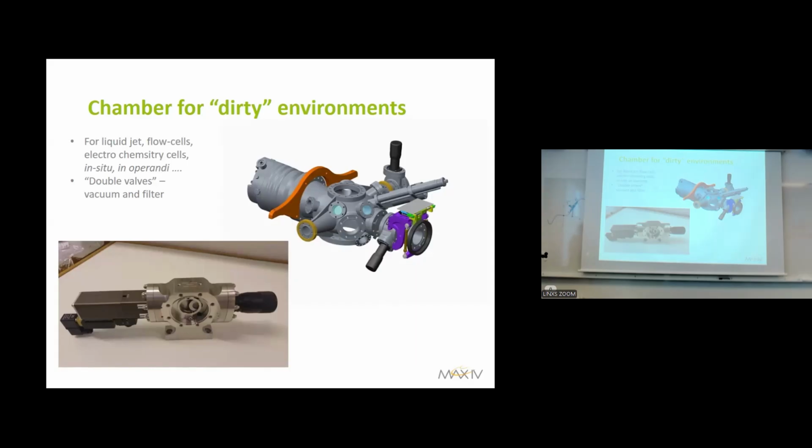And this has been even further refined by our beamline scientists. So now I think we can run the inner atmosphere. We added some differential pumping stage on this, and added further differential pumping on the sides, more liquid nitrogen traps to collect all the vapor and everything. So I think now we can measure something like 10⁻² atmosphere in the innermost chamber, and still have good enough vacuum to be able to open and let the beam in. With filters, but still, this means that we can do a lot of things.